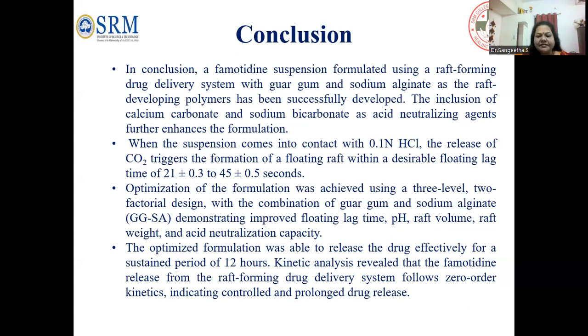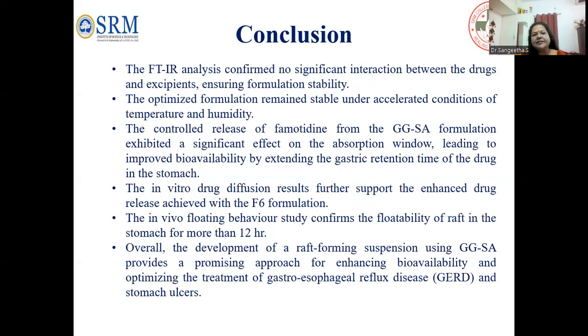Kinetic analysis revealed that famotidine release from the raft-forming drug delivery system follows zero order kinetics, indicating controlled and prolonged drug release. The FTIR analysis confirmed no significant interaction between the drug and excipients, ensuring formulation stability. The optimized formulation remained stable under accelerated conditions of temperature and humidity.